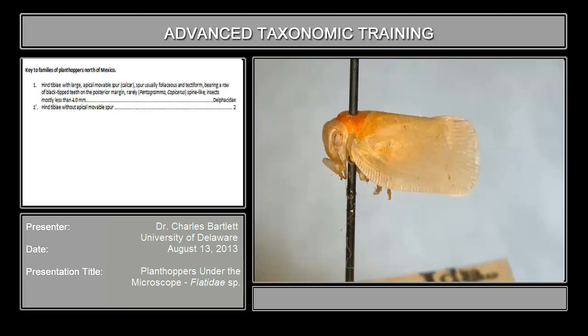I'm Charles Bartlett from the University of Delaware. You have something that looks about like that — the specimen you have is a green one, and if you happen to get the wrong one we'll know momentarily. We know this is a phlegoromorph because the antennae is below the eyes, the ocellus is right down here, and if you looked at the face you would see the carinae.